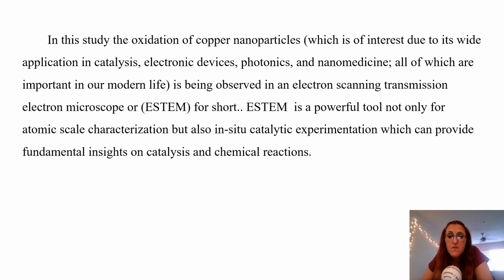ESTEM is a powerful tool not only for atomic scale characterization, but also for in situ catalytic experimentation, which can provide fundamental insights on catalysis and chemical reactions.